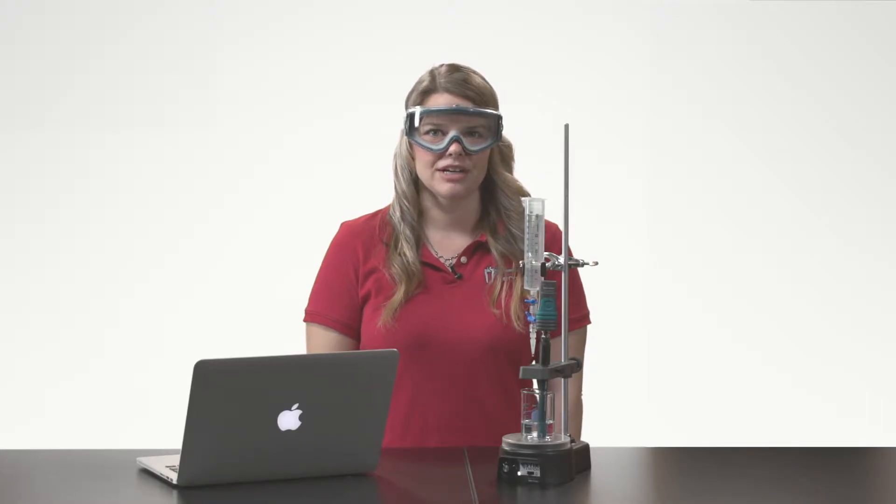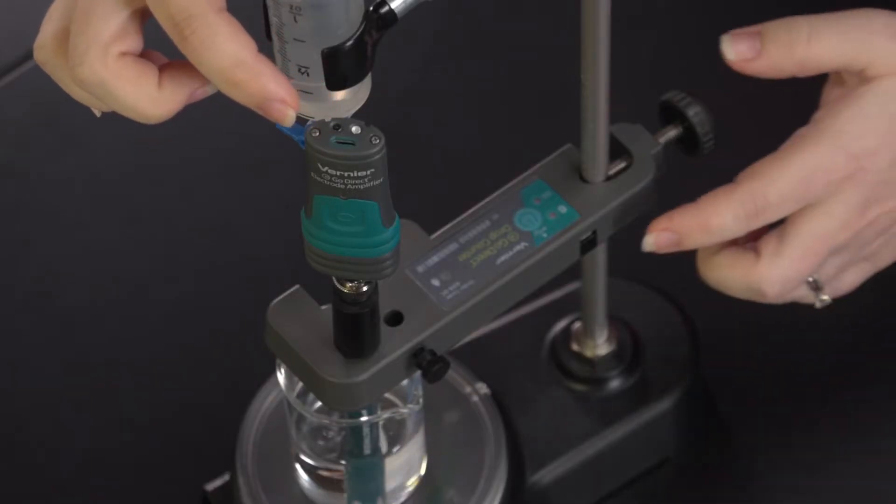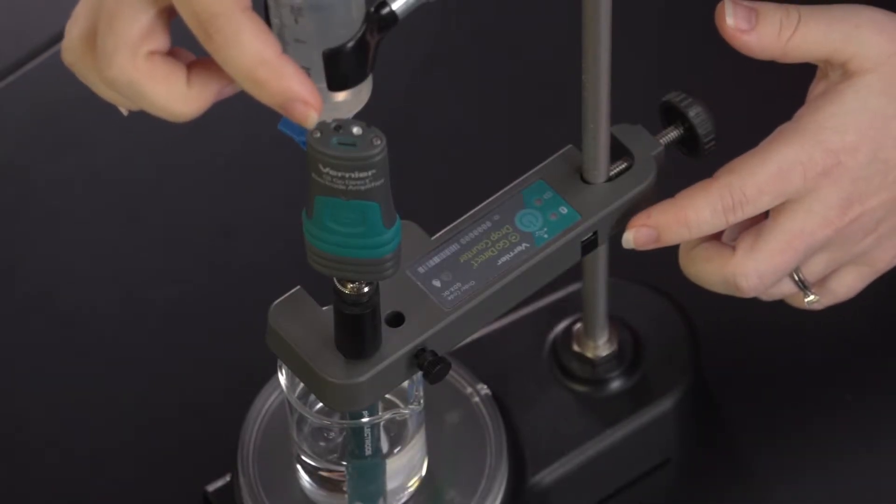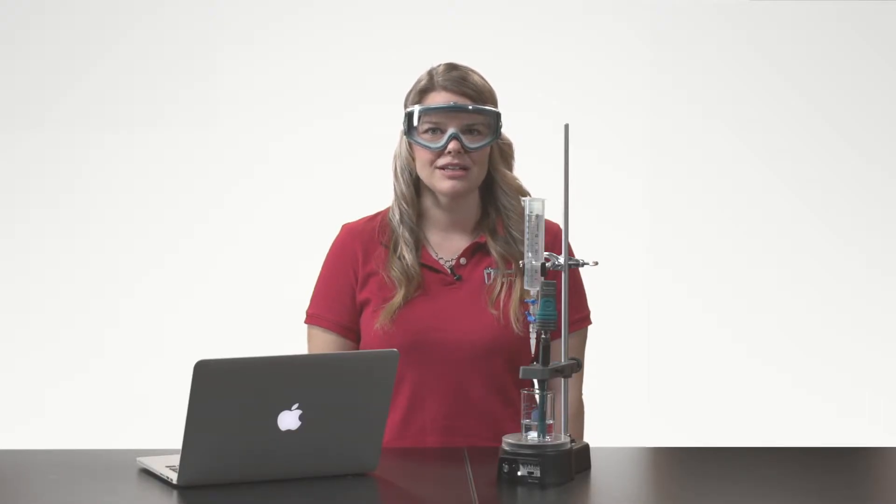The GoDirect pH sensor and drop counter can be connected via USB or via Bluetooth to your platform. The platform can be a Chromebook, Mac computer, Windows computer, iOS, or Android device. To get started, make sure you have downloaded the Graphical Analysis 4 app from our website or from the appropriate app store.